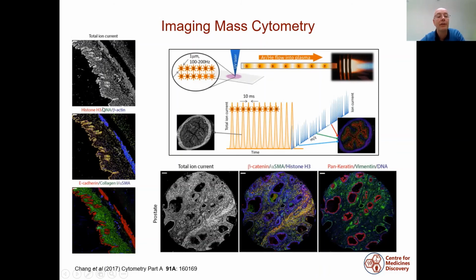And then overlaid onto that, we have antibodies for 3 different types of molecules. So we have antibody for histone H3, that's in red, antibody for DNA in green, and beta-actin, a structural protein, in blue. And you can see this is, I guess, the basal lamellae of the tissue.